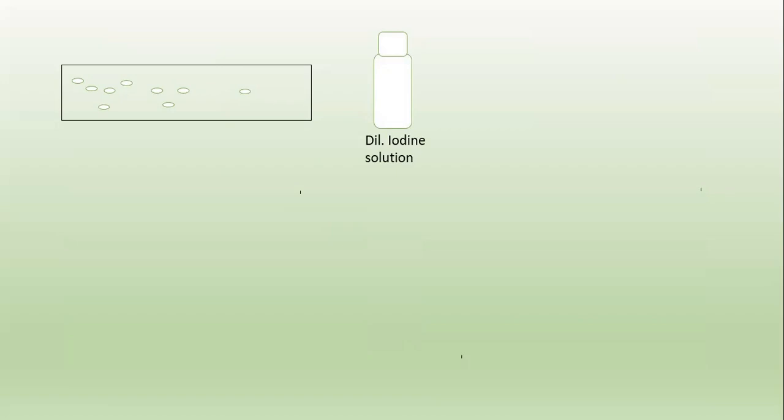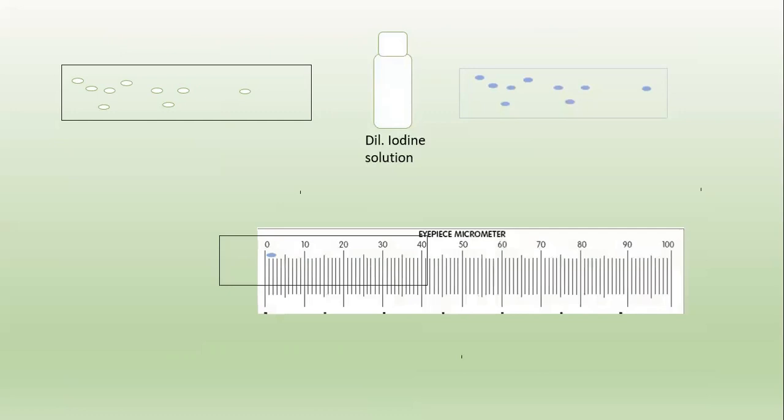First, let's see the measurement of the diameter of the starch grains. Take a slide — these are the starch grains which are to be observed in the microscope. It is quite difficult to observe this starch grain, so we have to stain it by utilizing iodine solution. We have to utilize diluted iodine solution just to stain this one, and the starch grains are converted into blue color because of the iodine solution.